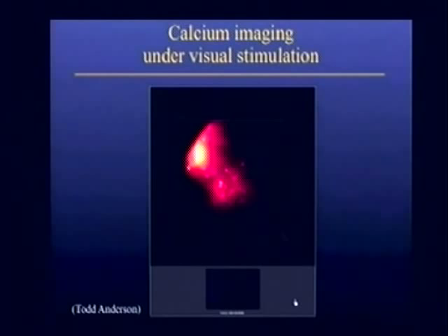And so what he did was he immobilized a zebrafish in jello, in agarose, and forced it to watch television. So what you'll see here on the screen are different patterns. There'll be small blue dots moving either to the right or to the left after this initial period of adaptation to the fluorescent stimulation. So there's the pattern. And certain neurons light up.